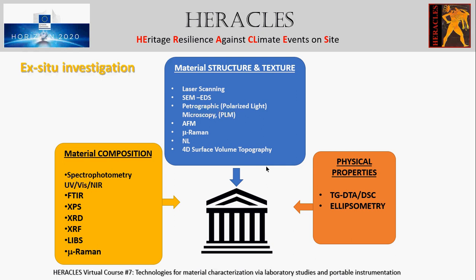Still in materials composition, in the material structure and texture, we have the micro-Raman technique, which is a spectrometry technique that can be used in any application where non-destructive and microscopic chemical analysis or imaging is required. It allows to rapidly characterize the chemical composition and structure of a sample, and almost no sample preparation is required, reducing the potential danger for cultural heritage artifacts.